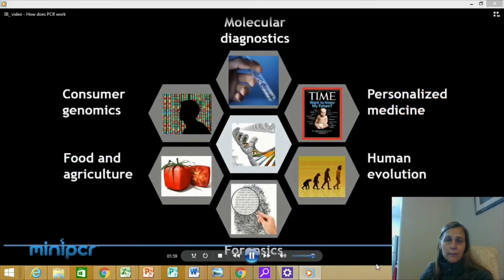This is enough DNA, for example, to detect a pathogen in blood such as HIV or Ebola, or to amplify trace amounts of DNA found at a crime scene, or to enable any of the other powerful applications.